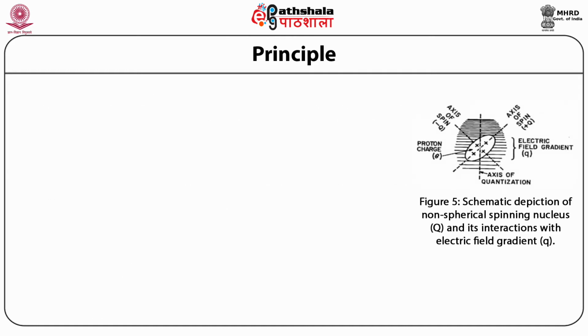So the figure shows the schematic depiction of a non-spherical spinning nucleus, that is Q, and its interaction with the electric field gradient.